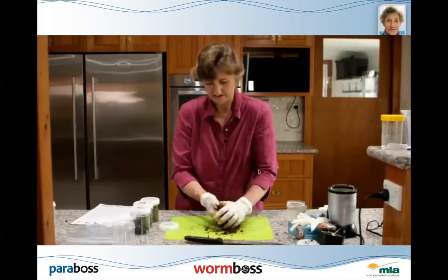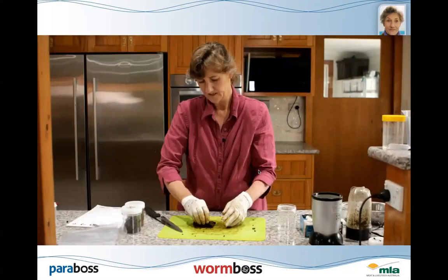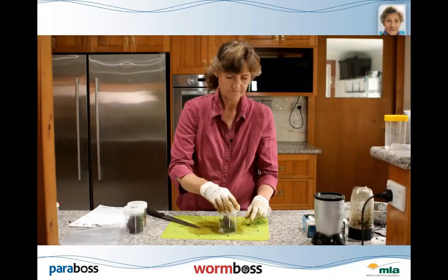Once you've done that, again, they can be put in your containers and sent to the lab, or you do your own sampling. If the samples are quite sloppy, usually they're pretty easy to mix. Just stir them a lot and you'll find that they will mix.